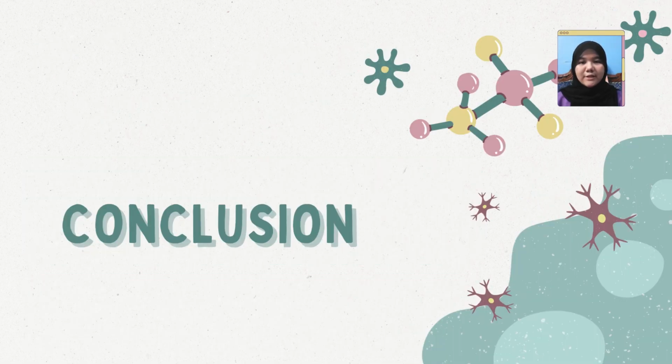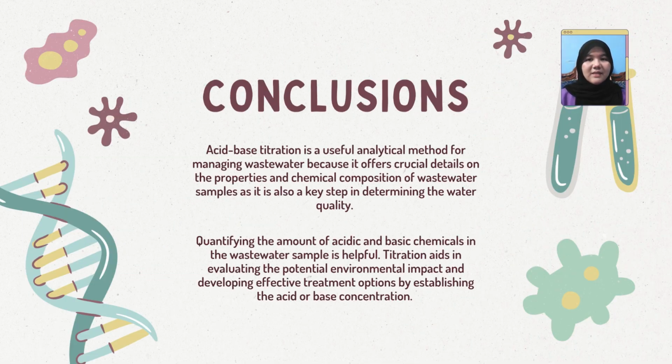Lastly, the conclusion. Acid-base titration is a useful analytical method for managing wastewater because it offers crucial details on the properties and chemical composition of water samples, as it is also a key step in determining the water quality.